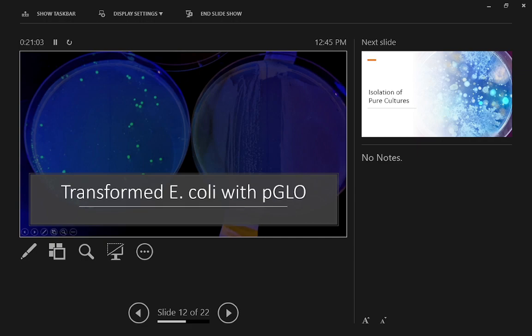This is the trick though, because we're adding liquids, if you're not very careful, liquids will spin around the edge, and that's what happened to these guys right here. This is the reason why. So you can see how they're really close to the edge and not in the middle like these guys. That's because there was a little liquid right here and it just went whoop, and it sped around the entire thing and you get a little contamination. So contamination, kind of a big problem here. So take your time, be careful.